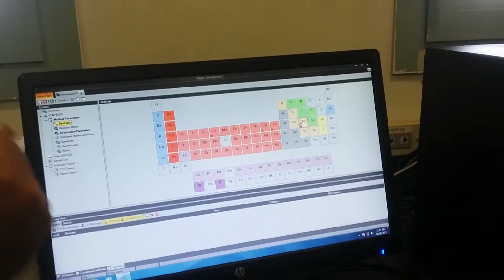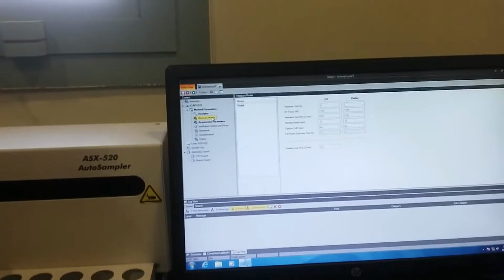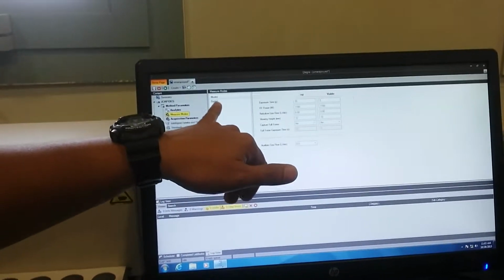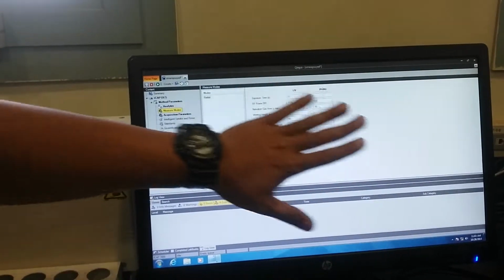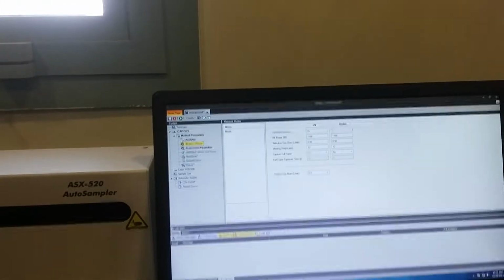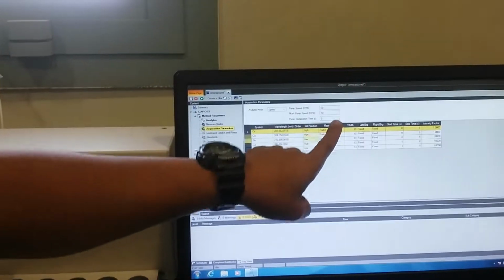And then, what's next? Go to measure mode. So you have to do it one by one. Choose measure mode. It's only radial. If you have a duo system, you will have axial. In this case, you will leave it as is, nothing to touch. Go to acquisition parameters, first one. One by one, you have to do it. So see, it's all radial.